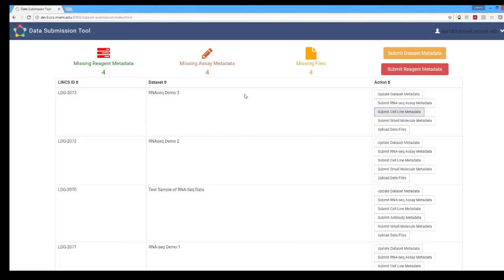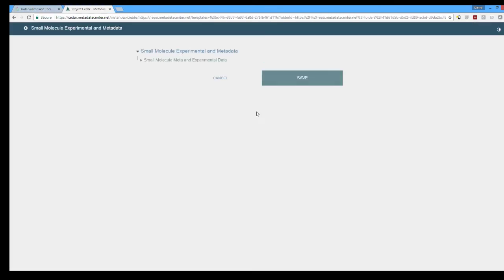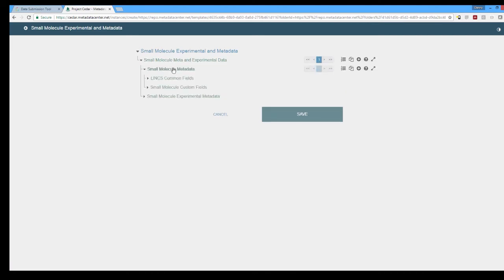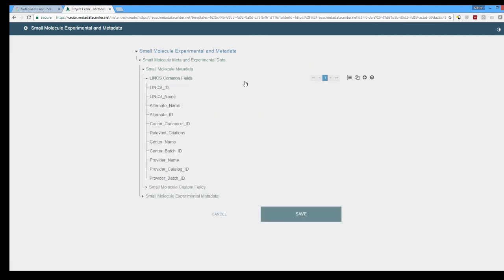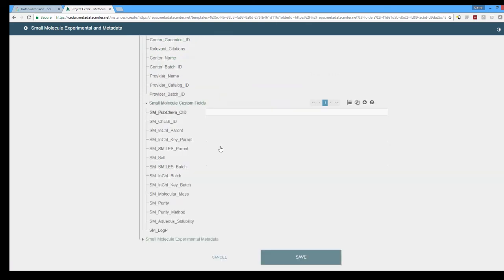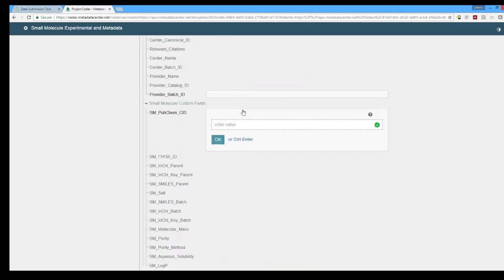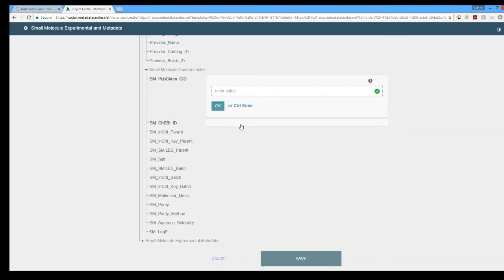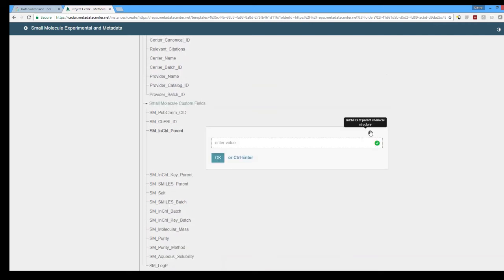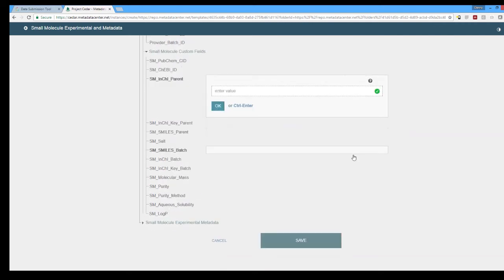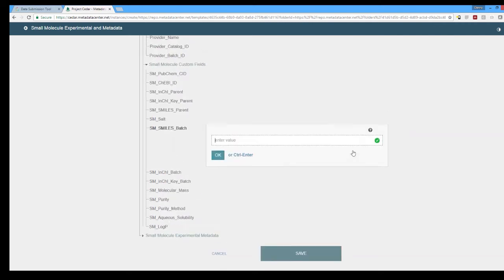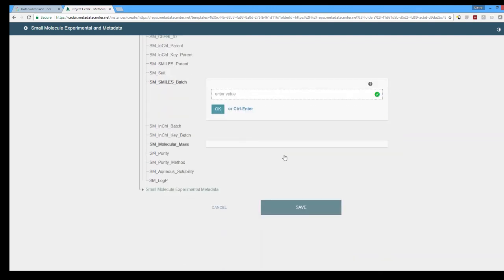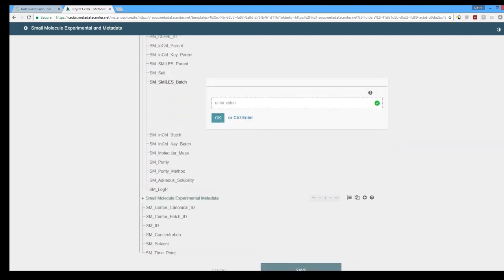As I mentioned before if we open up the small molecule meta and experimental data under small molecule metadata we have the Lynx common fields. You'll notice these are exactly the same as the other ones for cell line but for the small molecule custom fields they are vastly different and this is a key aspect for the DCIC and how we have our value added aspect that we do for the DSGC, the data generation centers, where we validate and ensure that everything they give us is all correct.